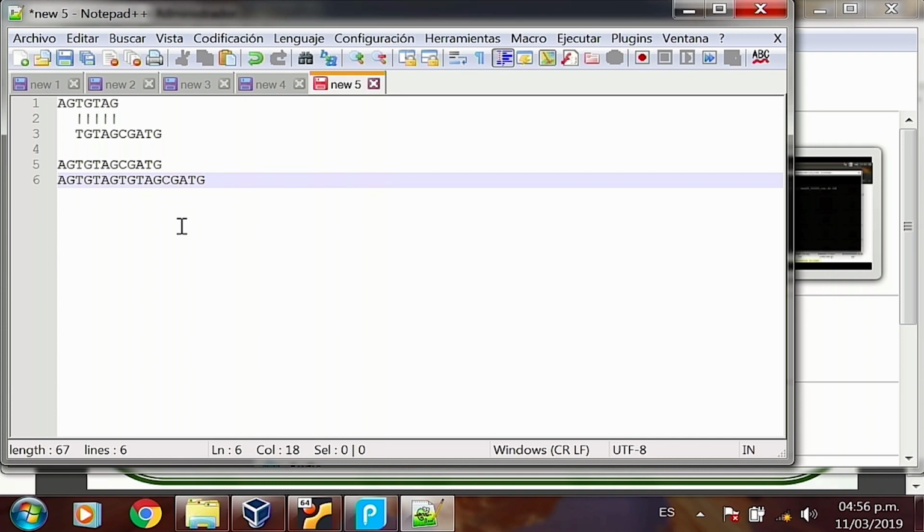Every assembly has some errors. They are not easy to deal with because they are inherent parts of each algorithm. And each assembler has its own way of handling them internally, trying to find out which are misassemblies and remove them from the whole assembly. But just because you have good contiguity metrics, which is what is most commonly reported in every genome assembly paper, that doesn't mean that you have a good assembly.